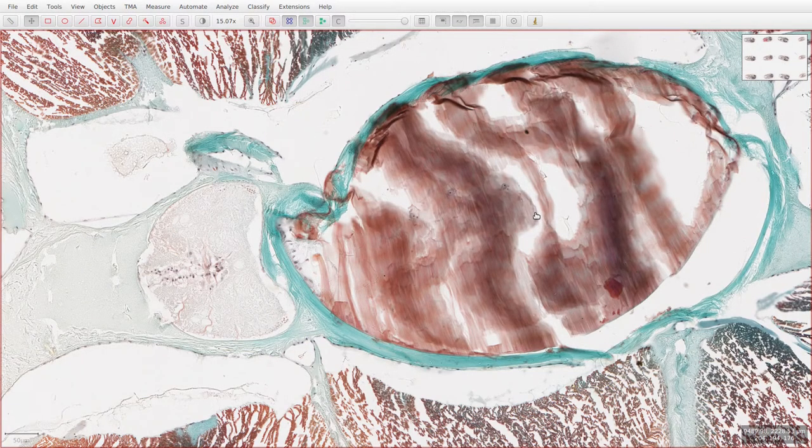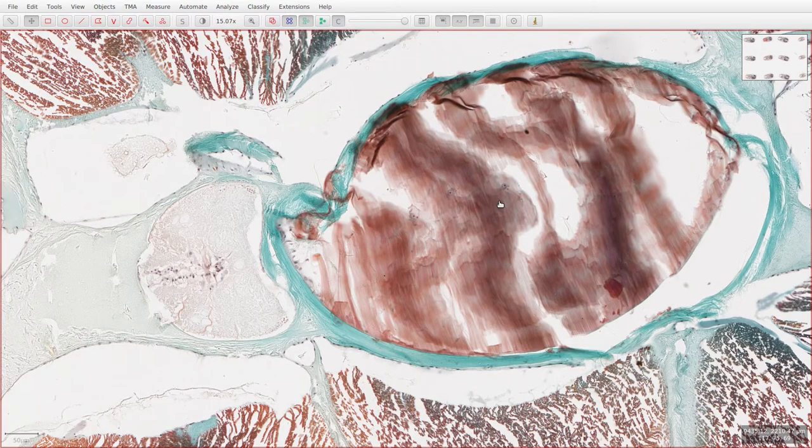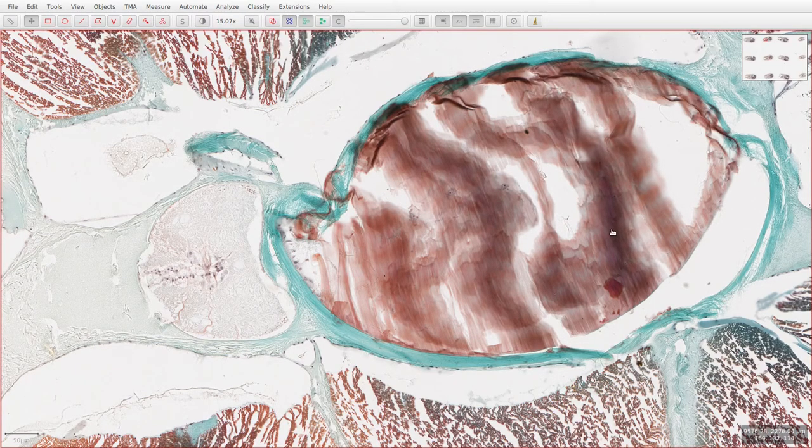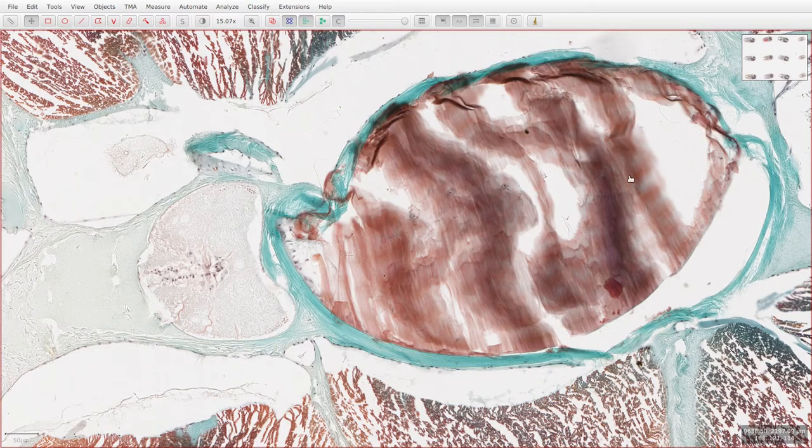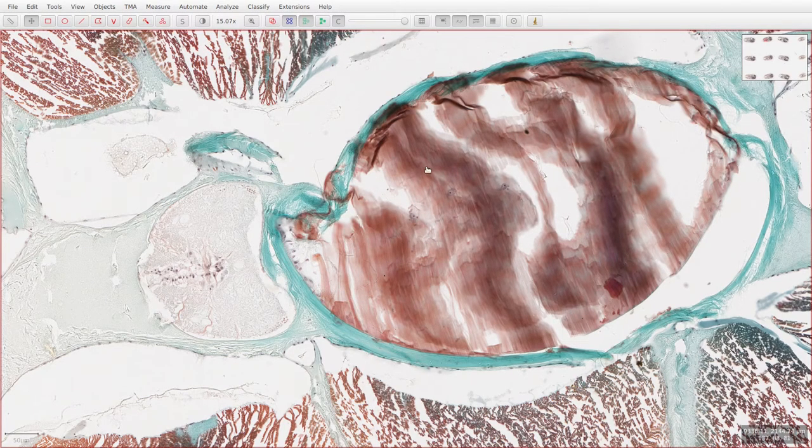So if we move on to the notochord now, which is just below the dorsal spinal cord. Remember this is a solid rod of tissue that extends all the way from the front of the amphioxus all the way down to the back.